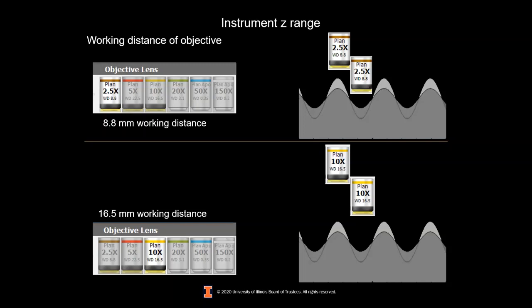data. Okay. This last question deals with different fields of view. When you take images with different fields of view, you'll often get different results for roughness parameters. Typically, lower values, Ra, Rq, occur with a smaller field of view, higher magnification. What would you recommend in order to determine the roughness value of a sample, assuming the feature size observed by these different magnifications is used?